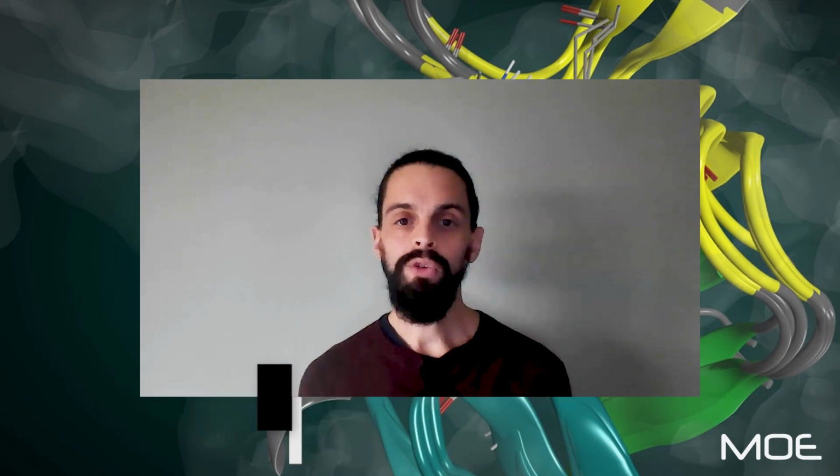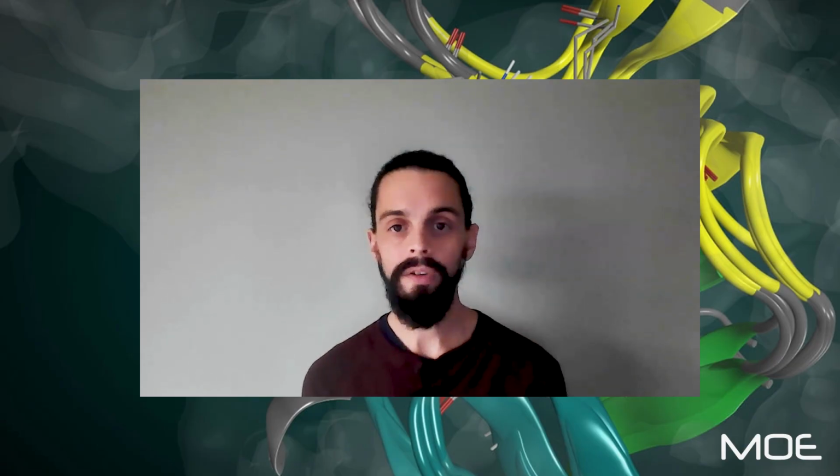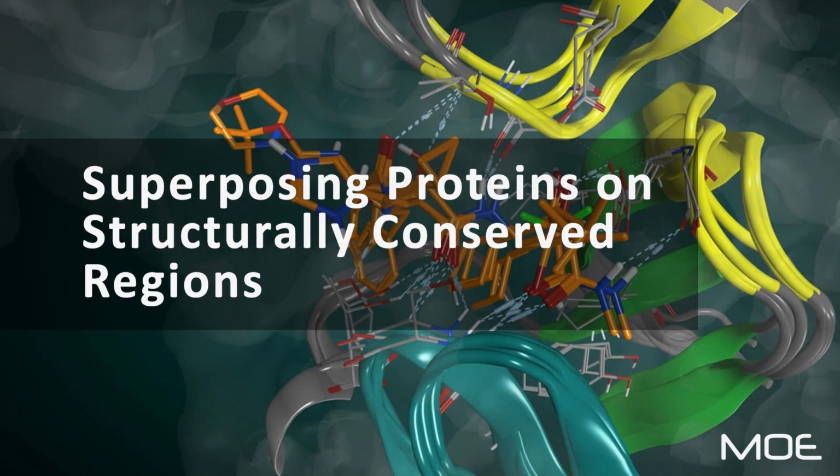Today I'd like to show you how to align the sequences from two or more proteins and then superpose their structures. This would be a useful workflow when we want to compare binding pockets, identify structurally conserved regions, or for homology modelling. So let's get started.